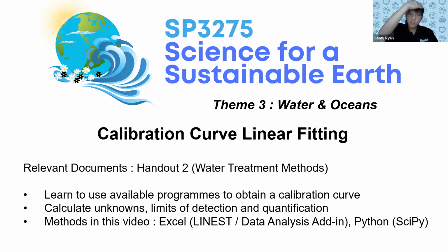So this video will just be a tutorial on how you can use Excel, specifically two methods, LINEST and the data analysis add-in, as well as how to use Python. Specifically, the package that I used was SciPy. If you know of other methods, please feel free to use them or to let me know, and maybe I can include them in future content. But yes, so let's go into the topic.